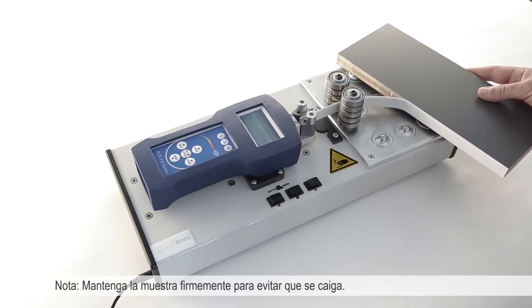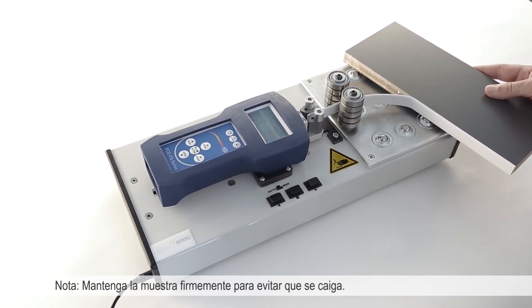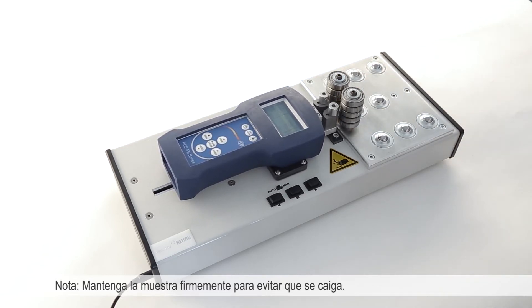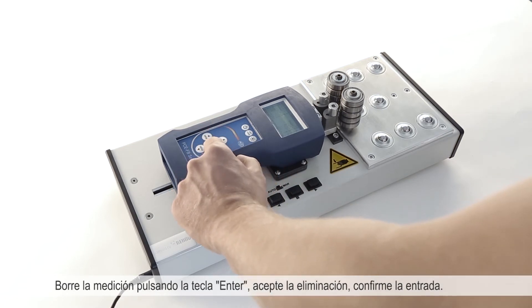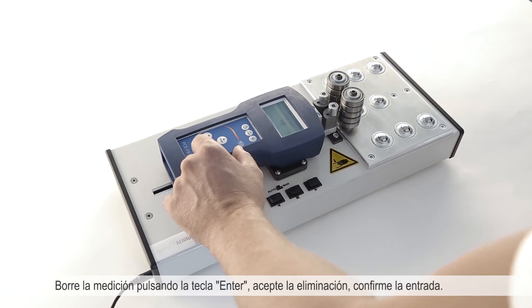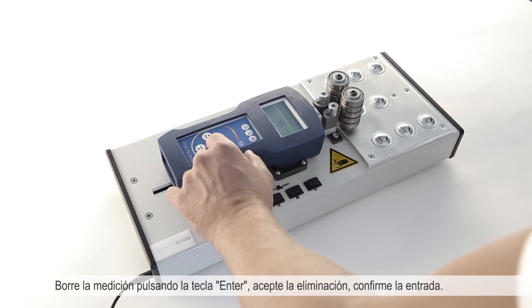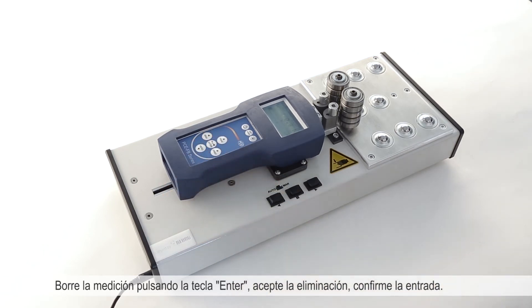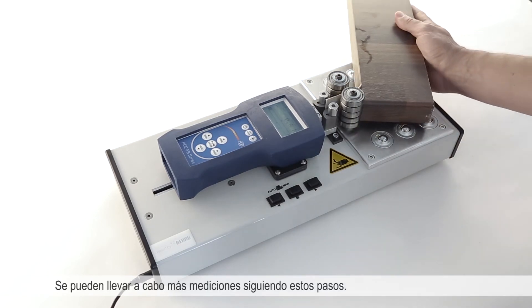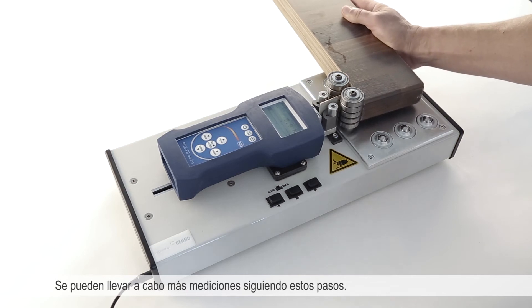When releasing, hold the specimen tightly so that it does not fall down. To delete the measurement press the ENTER button and acknowledge the deletion by confirming the entry. Following this, additional measurements can be carried out.